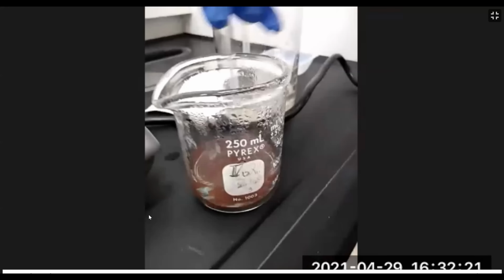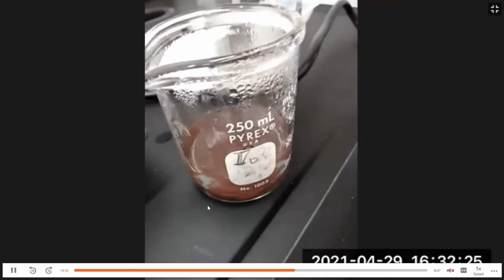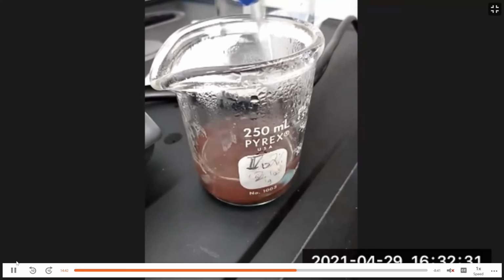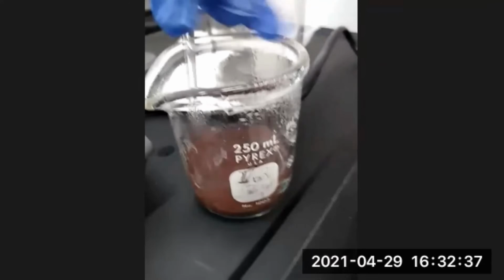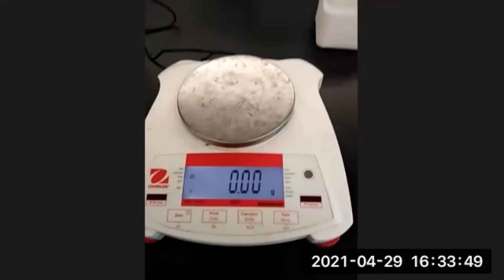After several minutes, you notice that the blue color is mostly gone from the solution, and we have our reddish brown precipitate, which is copper metal. So don't be surprised that some of these steps take a long time. You've seen a time lapse of this experiment.